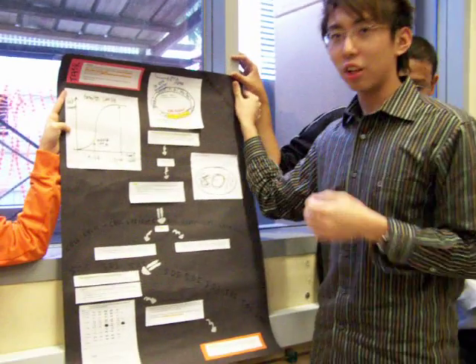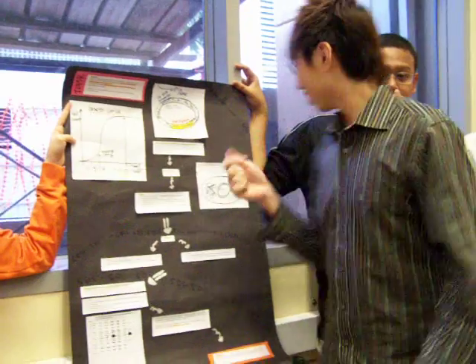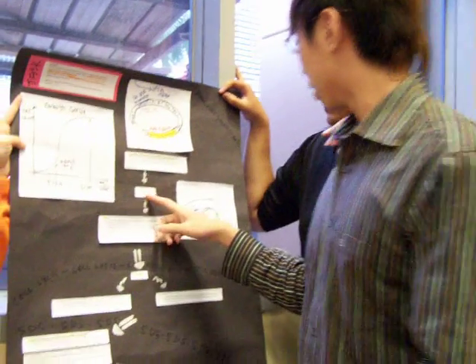Expression testing. Okay, until now you understand everything about it? Yeah. Okay, right? Yeah. So, expression testing. After the expression testing, you do the control.